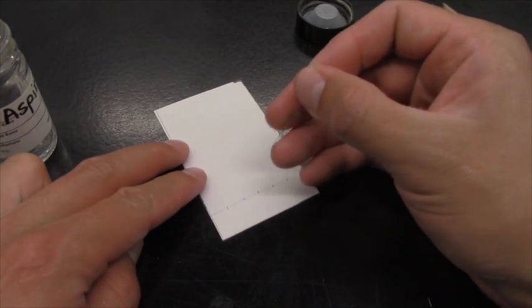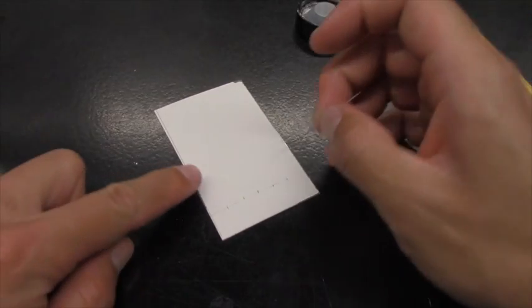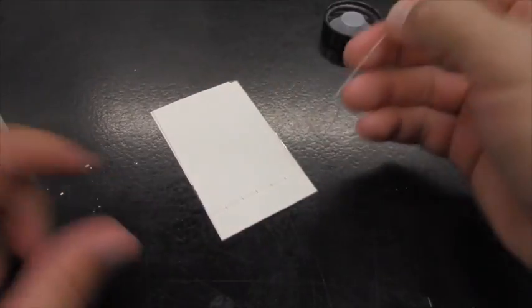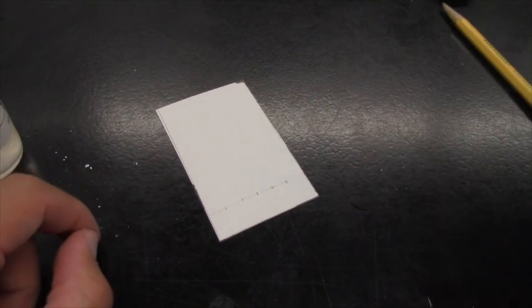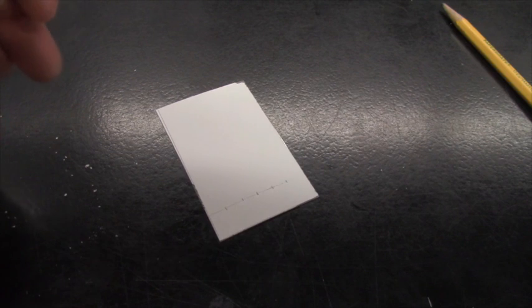Now you can see I'm just going to spot the rest of the compounds onto the TLC plate. Again, try not to put too much onto the plate. And once this process is done, then I will be ready to develop the TLC plate. It's also a good idea to label your different lanes on your TLC plate so that you know what sample you're spotting on each one.